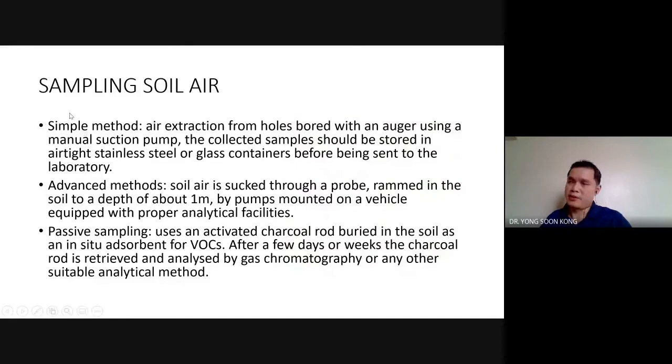Okay, now you have learned how to collect moisture sample from the soil. But what about air sample? I don't think I need to describe this so much. Whatever that you use in the air sampling, if you have any mechanism to block the soil particles from entering that equipment, that's it. You can do it.